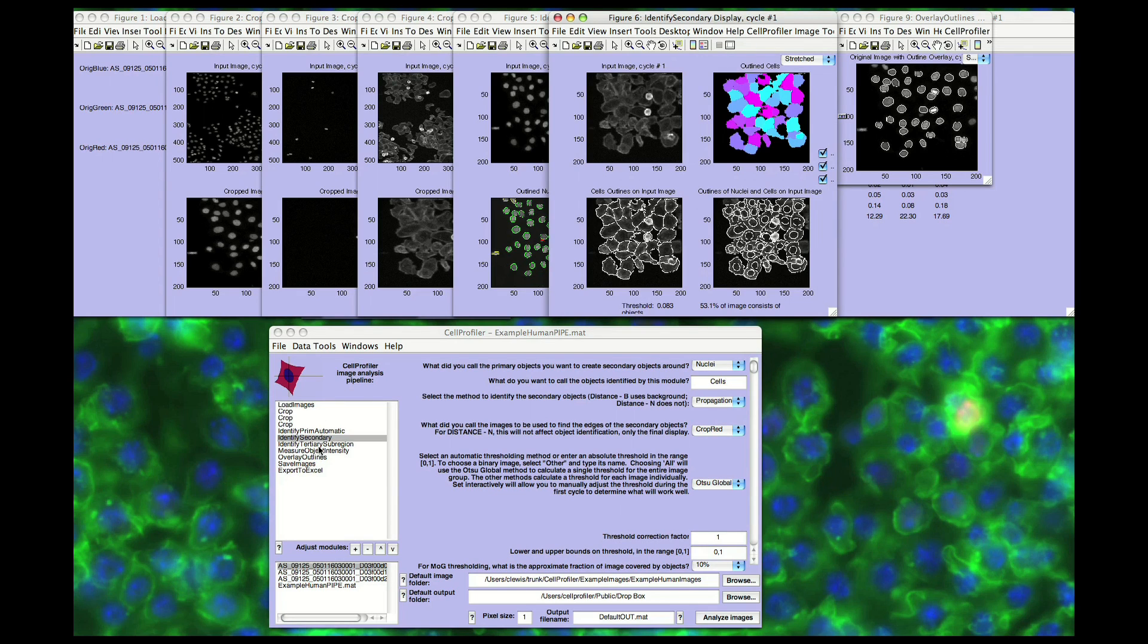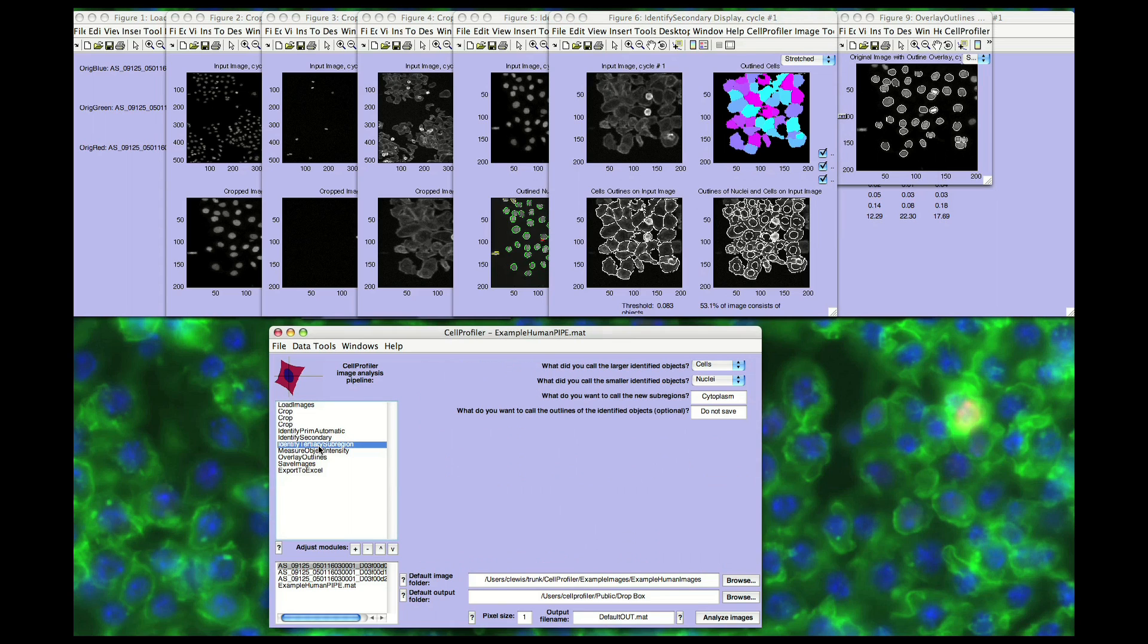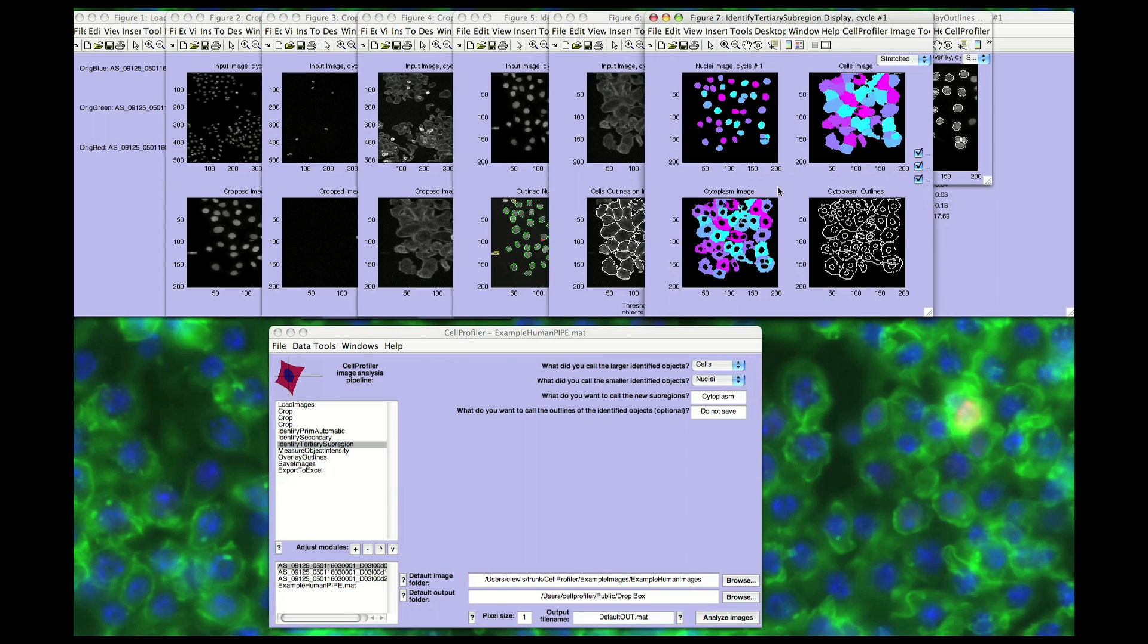Other cellular compartments can also be identified, including the cytoplasm, the part of each cell excluding the nucleus, and the cell or nuclear membrane, using the Identify Tertiary module.